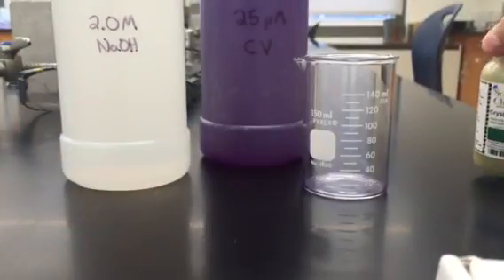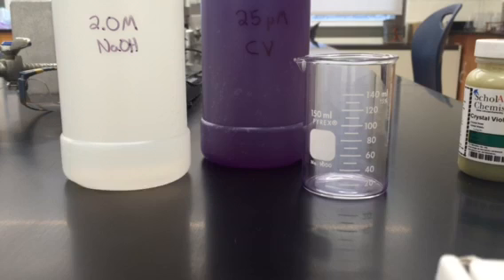The solution that is being provided here is the solution we will use in our lab. It is 25 micromolar, which is obviously a very low molarity.